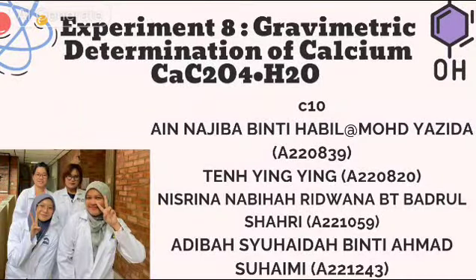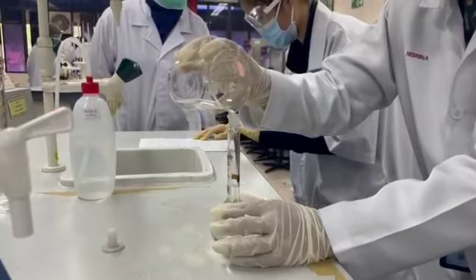We are from Group C10 presenting Experiment 8, Gravimetric Determination of Calcium. 1. Preparation of the unknown solution.